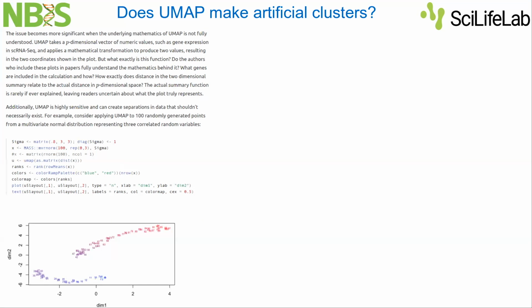Although UMAP is a more advanced version of t-SNE in terms of the number of hyperparameters. UMAP has many more hyperparameters. The number of nearest neighbors is a very famous parameter, but if you actually check UMAP, it has bandwidth and learning rate, so many hyperparameters that you actually never use. But if you do use them, you can create more advanced plots compared to t-SNE to see more nuanced patterns in your data. Otherwise, if you go just for default parameters, t-SNE and UMAP tell you the same story for good sample size.